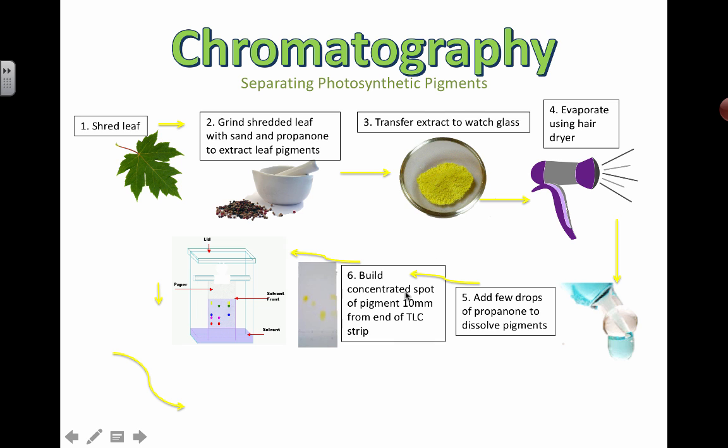Then you're going to take some paper and build a concentrated spot. You could use the back of a pinhead or a really thin capillary tube, and you're going to put little spots on a marked line and let it dry. Then keep dabbing it — you don't want it to spread out too much. You want as much of that concentrated solution as possible in a little spot. Two or three dabs is probably enough.